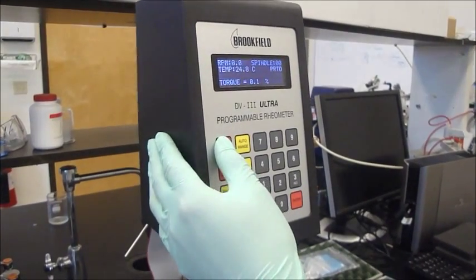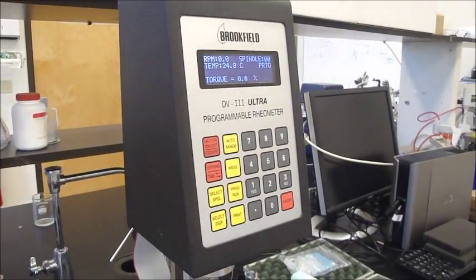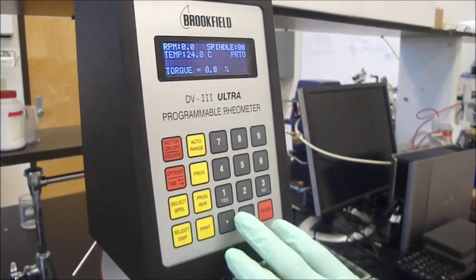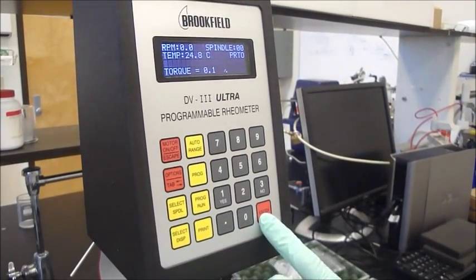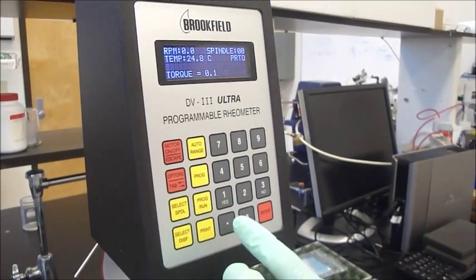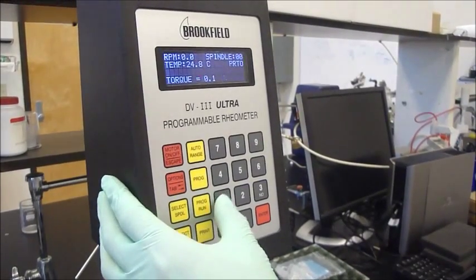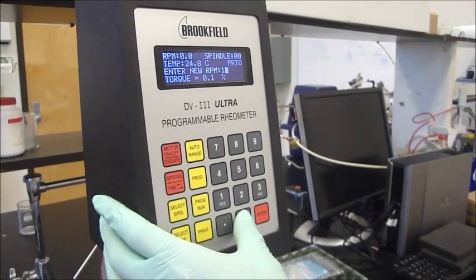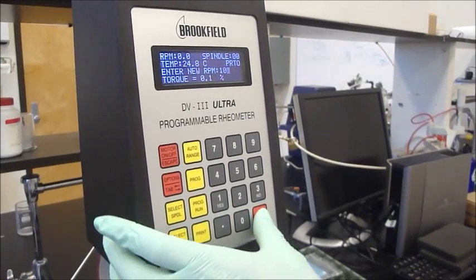Turn on the motor and enter the speed of rotation by using the number pad here and the enter key. For example, we will start from 10 RPM. So we input 1, 0 and then enter.